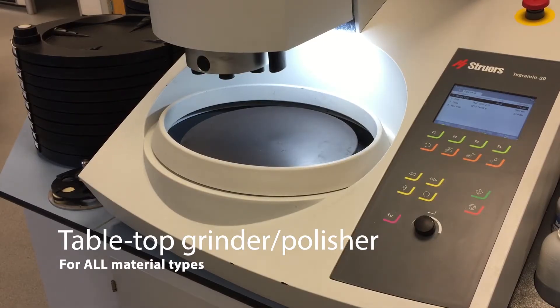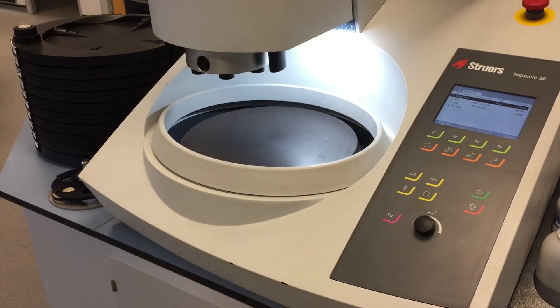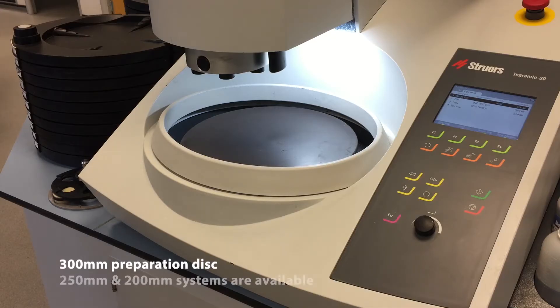Hello everybody, today we're going to have a quick introduction to the Struers Tegramin. This is the Tegramin 30, which is the largest of our bench top machines. We also have the Tegramin 25 and Tegramin 20, which have the 250mm platen and the 200mm platen.